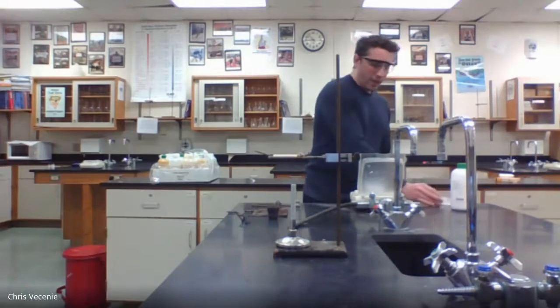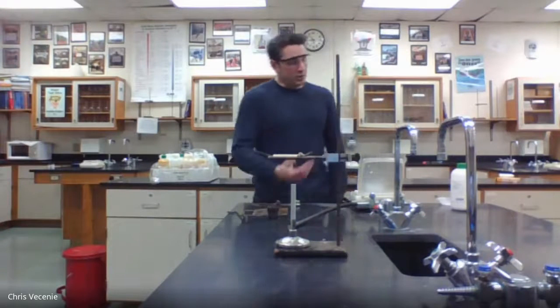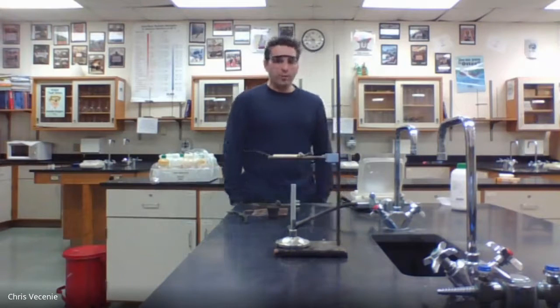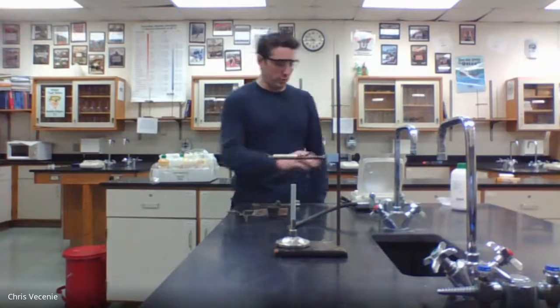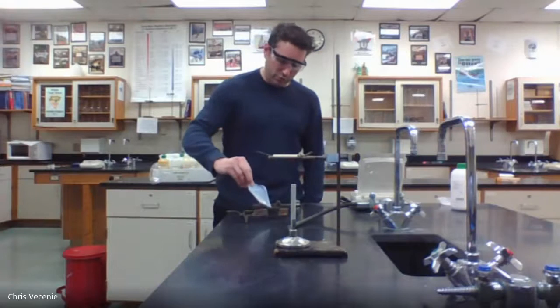All right, so like I said, I don't even really care, that was a ballpark number. My balance reads 2.17. For me, that's close enough, because all I really care about is making sure I get about that much into the crucible. So I'm going to come over here and transfer it into the crucible.